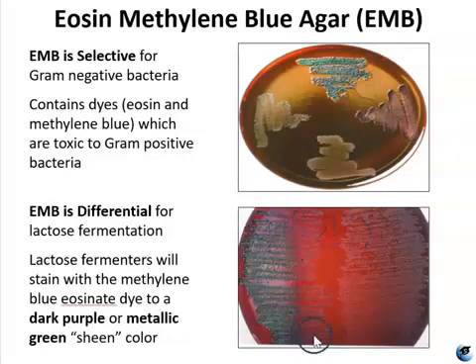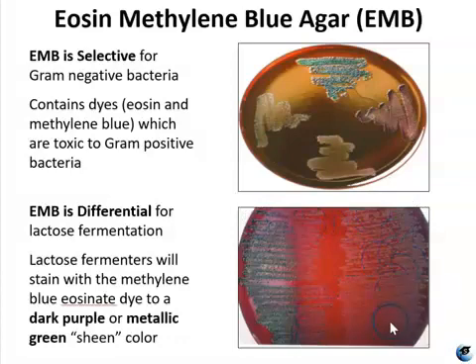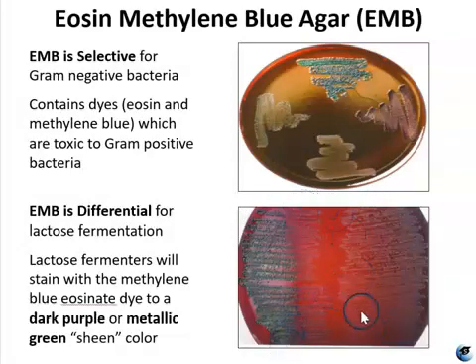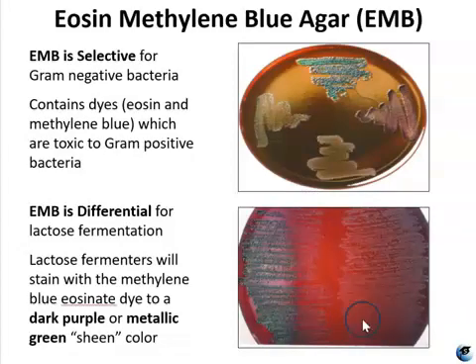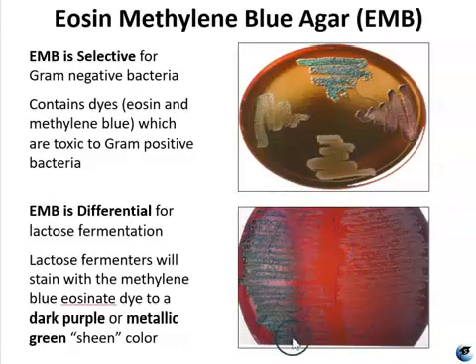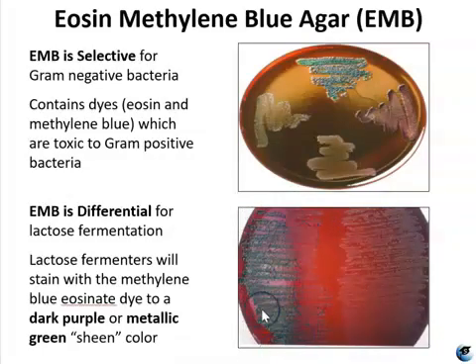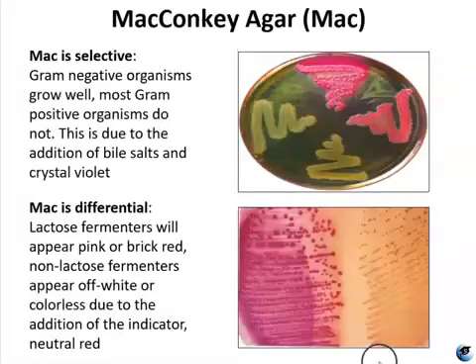On this plate, there is a species on the left and a species on the right. Both are showing good growth, so you could say both are most likely gram-negative species. For the one on the left, we are seeing the color change happening, so you would say that species most likely ferments lactose — and this one on the right does not.